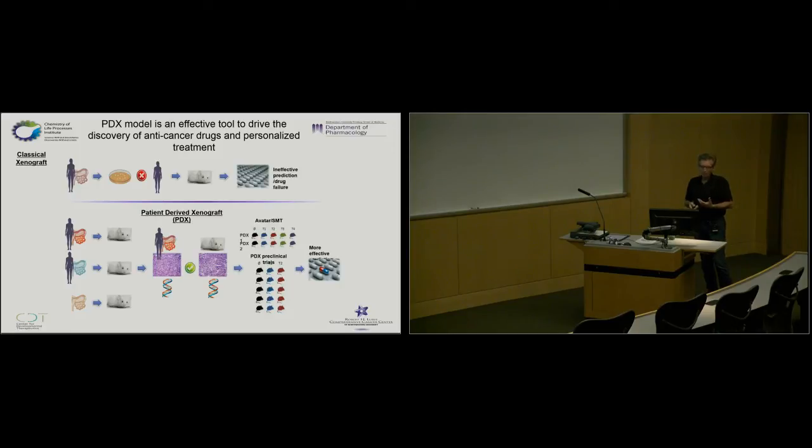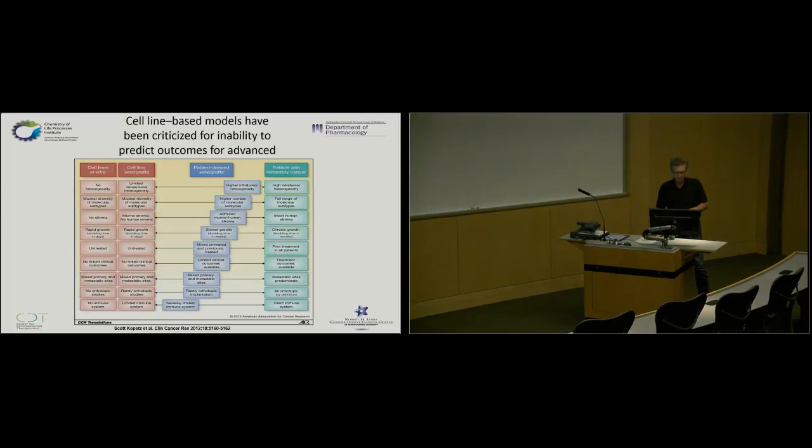From a practical perspective, that creates the problem of actually trying to stage these animals, because we wait till our tumors grow till we see them, either subcutaneously or, in the case where we do orthotopic models, we're able now to label these patient-derived xenografts with reporters, and we can follow them by imaging. But until we see an image, for example, in an orthotopic tumor, we won't start treating. The problem is they have 40 mice, and they keep coming up at different times. So that really creates a problem for the person that's doing the experiment, because they have to stagger when they start the treatment and when they end the treatments. These are things that we're able to overcome, but they're actually a lot more difficult to do with the patient-derived xenograft than they are with the traditional xenograft.